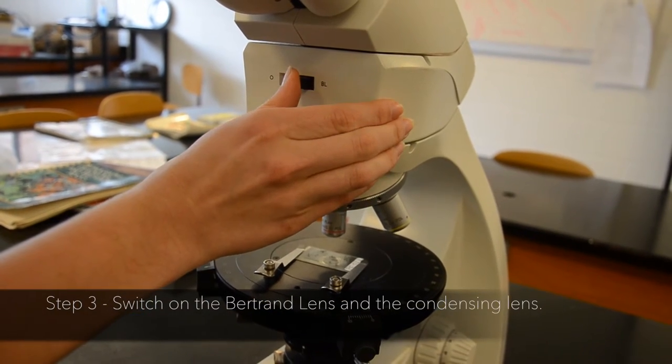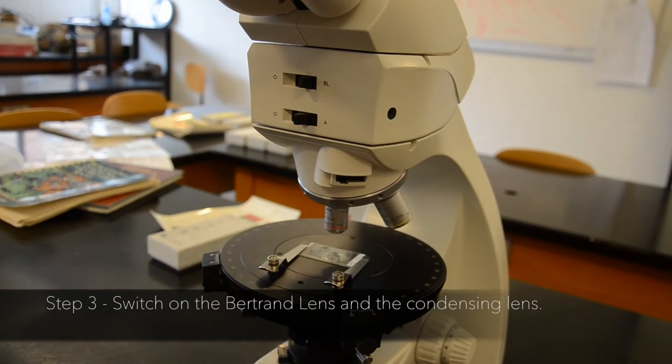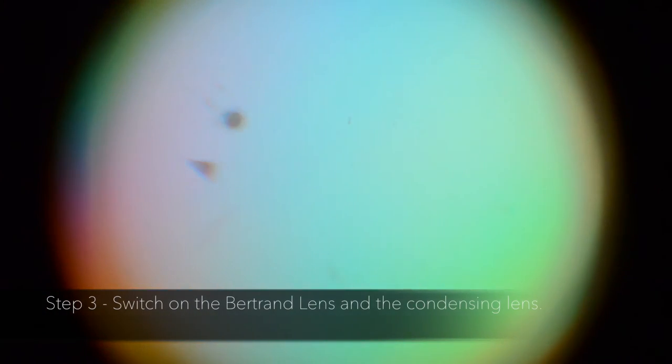Step 3: Switch on the Bertrand lens and the condensing lens. On this microscope, the switch labeled BL above the cross-polarizer switch inserts both.